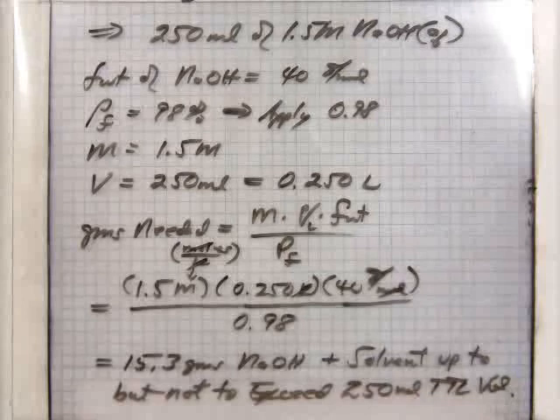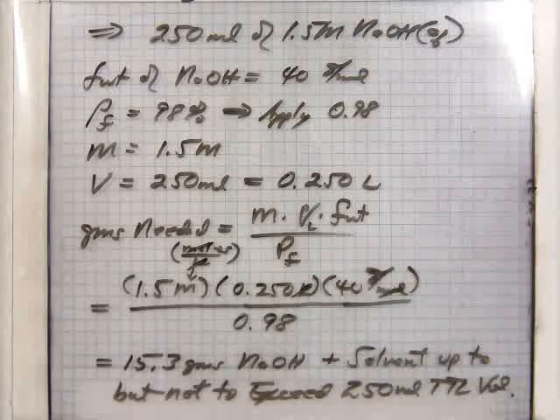So it's a very straightforward calculation in terms of, well, I got a bottle of something, I need to ask myself, how much do I take out and dissolve? As simple as that. Now, there are many mixing containers, and you'll work with one, 100 mil volumetrics, and we'll show you that as we do the demonstration and how things function and what have you.